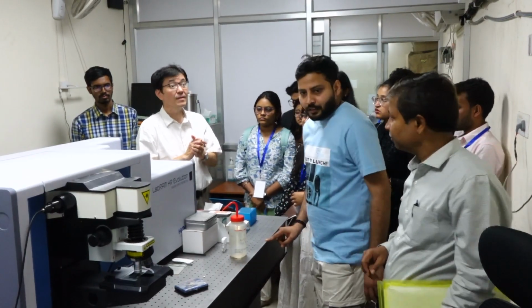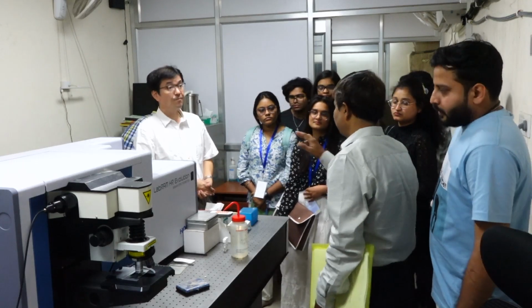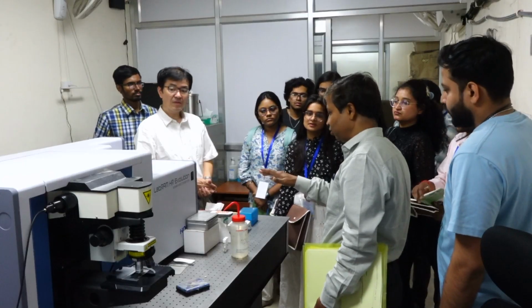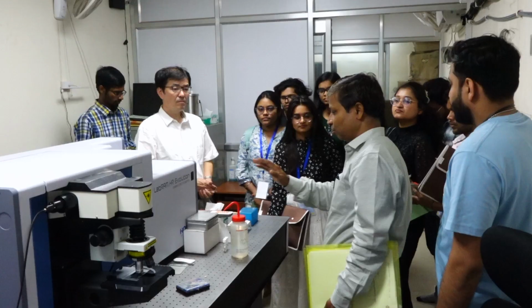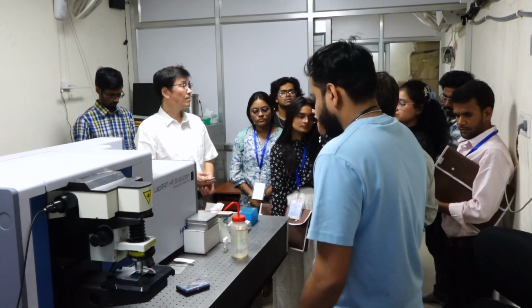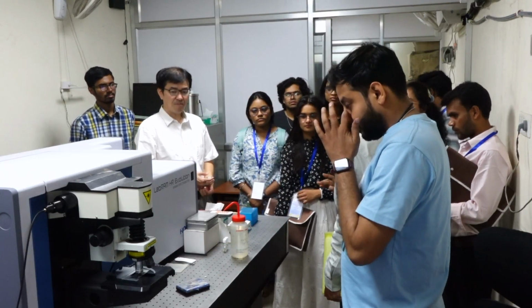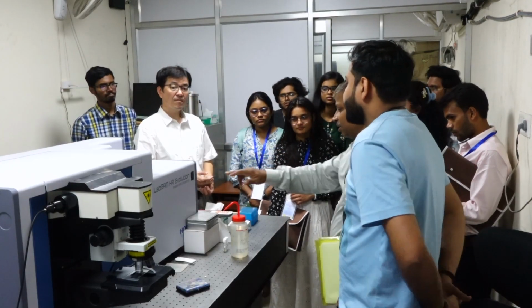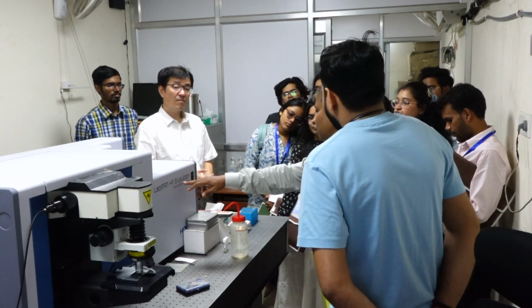So, started. Yes. So now, as a part of the instrumentation, Professor Hiramatsu will teach you about this instrument. This is the instrument which records the Raman spectrum. As I have shown you in the slide, there are various kinds of Raman spectrometer. This is one of the best. It is made by Horiba, a Japanese company, and this name is LabRAM HR. HR stands for High Resolution Evolution.